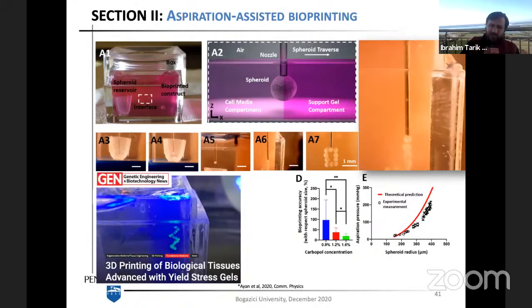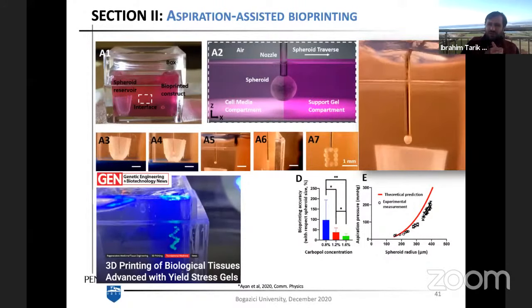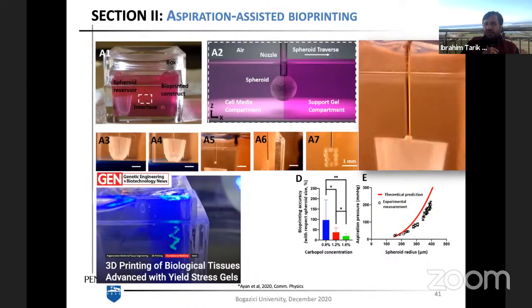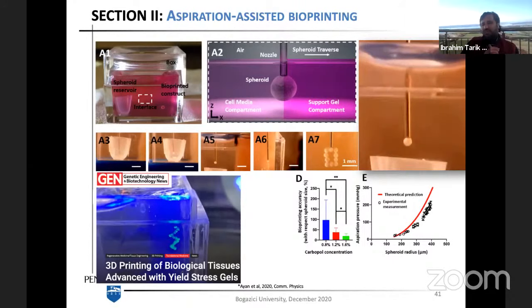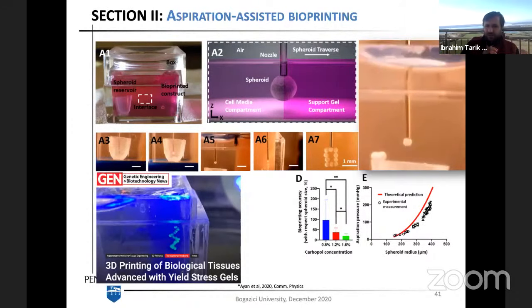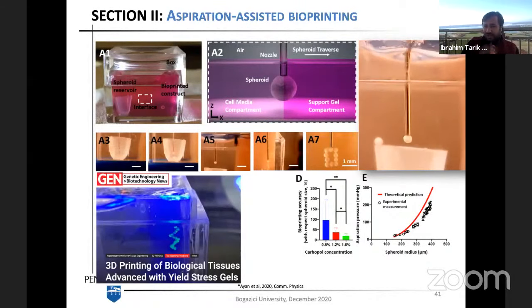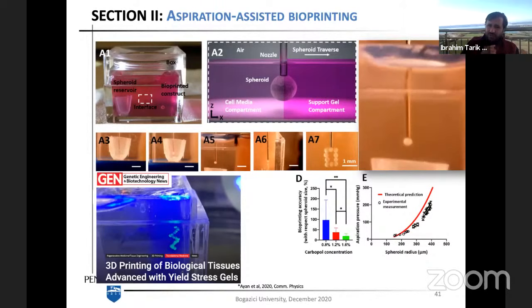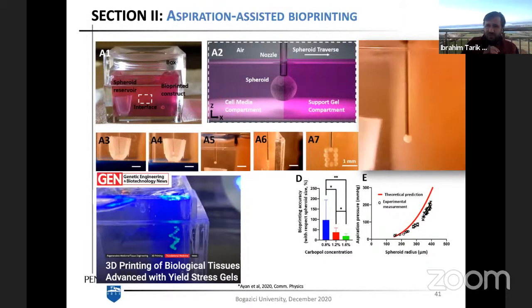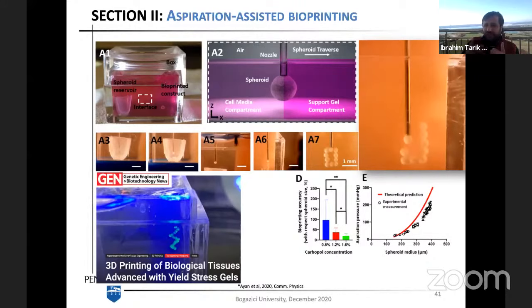So we're further improving this technique, and particularly the support bed here is very critical. Some support beds are not really super nice for biological applications, and some support beds are not really super nice in enabling precise deposition of these spheroids. Sometimes you can't really precisely put that in the designated point. So in this regard, we are actually synthesizing and developing new support beds that enable us to precisely bioprint these spheroids, as well as being transparent. That means you can see it as you see in the video, right? Because this is very important, and biologically defined, and facilitates the fusion of these spheroids.